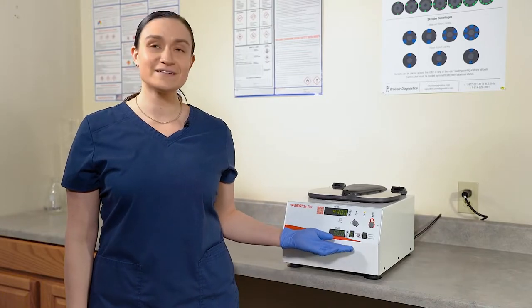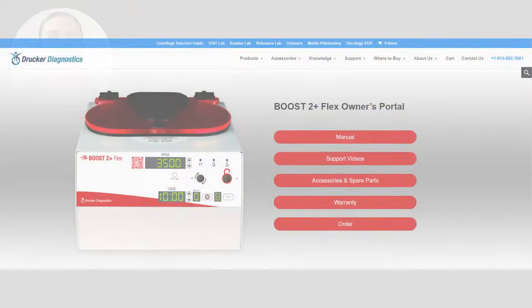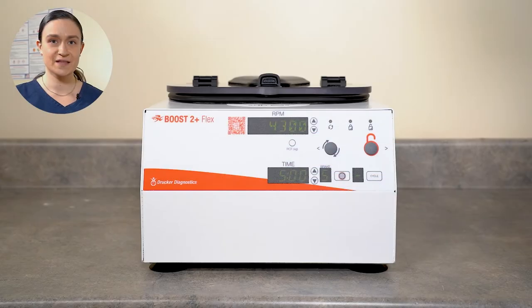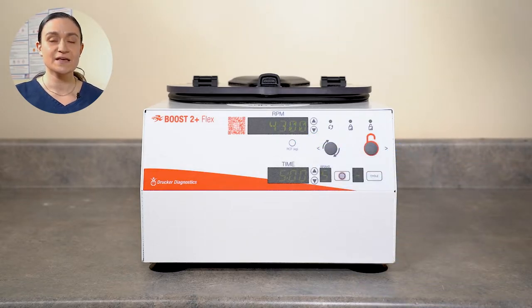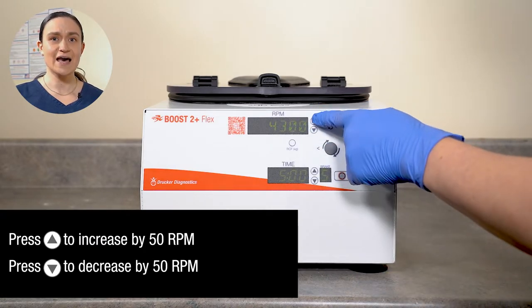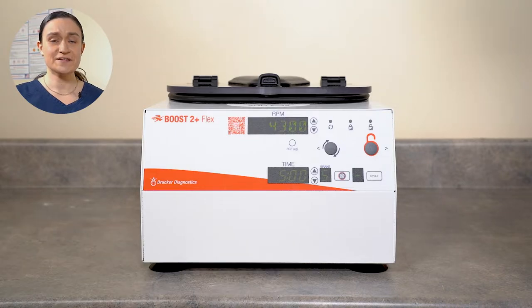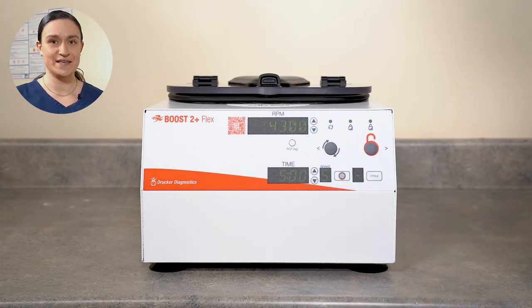Now that we have our Boost 2 Plus Flex set up, we can take a look at our controls. Part 2: Controls Overview. Your Boost 2 Plus Flex has all of its controls right here on the front panel. There is a QR code on the front panel — when you scan it, it will link you to a page allowing you to access the manual, accessories, easy reorder, and other helpful features. Next is the RPM screen, which shows the currently selected speed in RPMs, controlled by the buttons to the right. A single press up will increase RPMs by 50, while a single press down will decrease by 50. As the RPMs change, the screen value changes dynamically, always representing the exact current RPM selected.